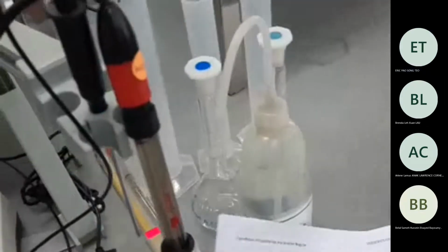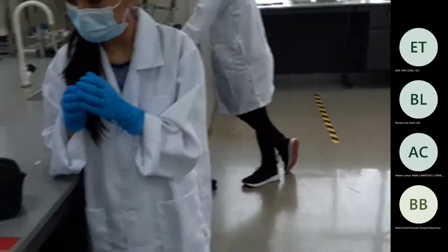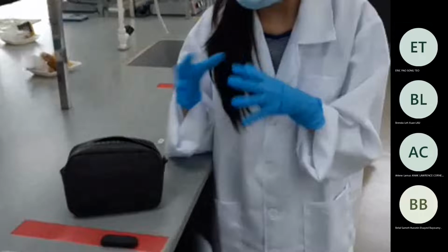Yes, exactly. Thank you. So the solution that helps to withstand the action of adding more acid or base to it, a small amount of acid or base. So we will see how the buffer solution resists the pH changes when adding acid and base to it, right? So first of all, what should we do for experiment 1? Anyone?